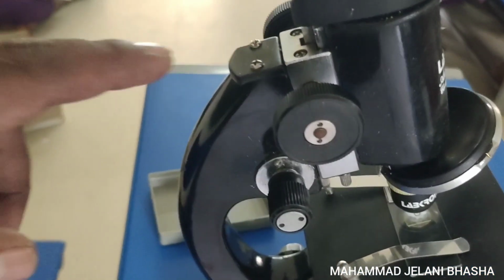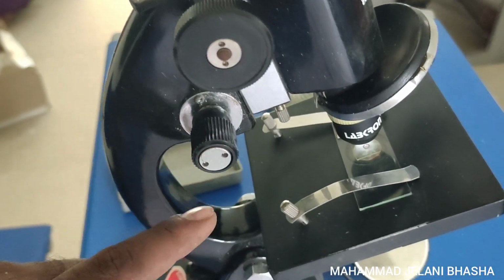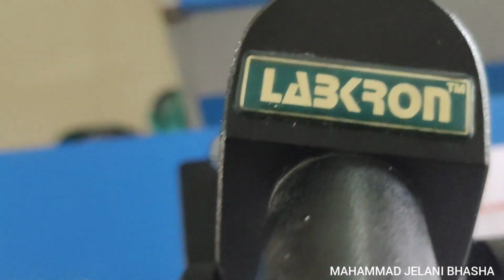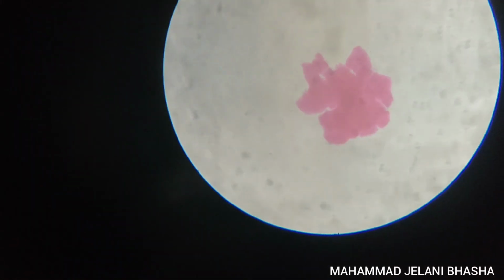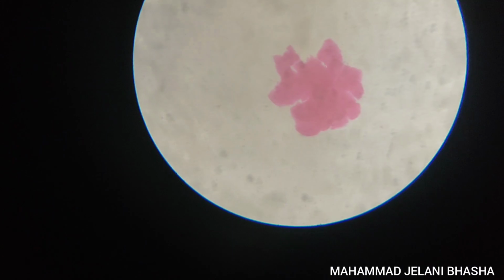That's this one, the first. This is the coarse adjustment, fine adjustment, and the arm. This is the arm, and you see we have here the eyepiece, 10x size. From this we can see the structure of amoeba, which is stained pink here. We can see very clearly the nucleus in the center, and also the pseudopodia are present in amoeba. It's beautiful.